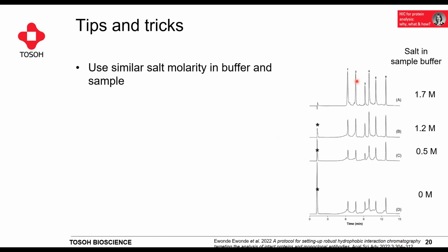And this is what we see here. So if we have our sample without any salt, a lot of the sample will already elute at the very beginning and will not be retained. The closer you get with your molarity in the sample buffer to the molarity in the buffer, the more will also be retained.